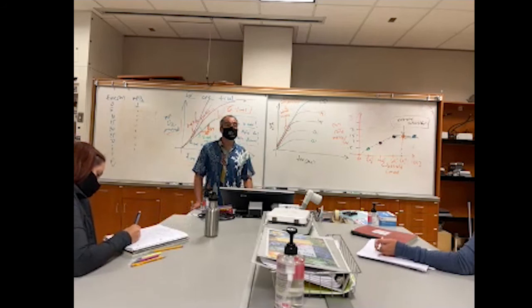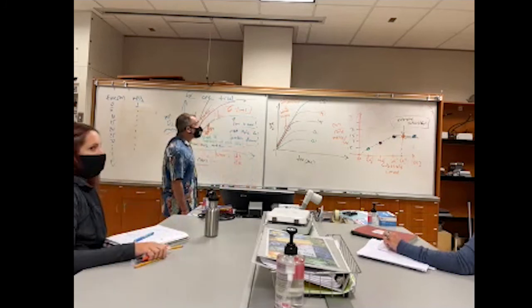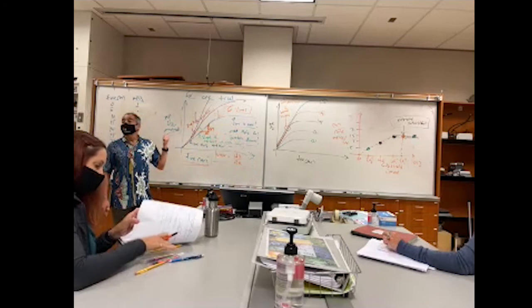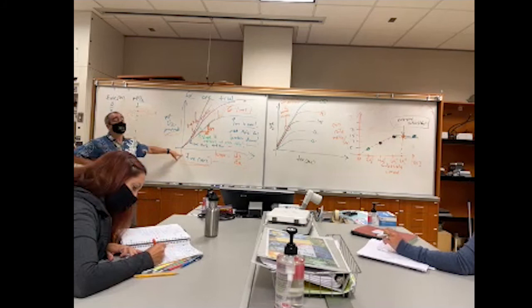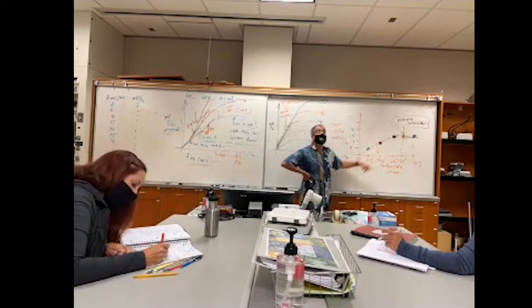So, other questions up to this point? This lab is one of the ones that tends to challenge people, I think because of the multiple steps to get to the dependent variable. And our dependent variable is reaction rate. To get the reaction rate for each case, you have to make this plot of time versus oxygen, and then do a best fit line and calculate a slope. And then finally, you get the number to put on this graph here.